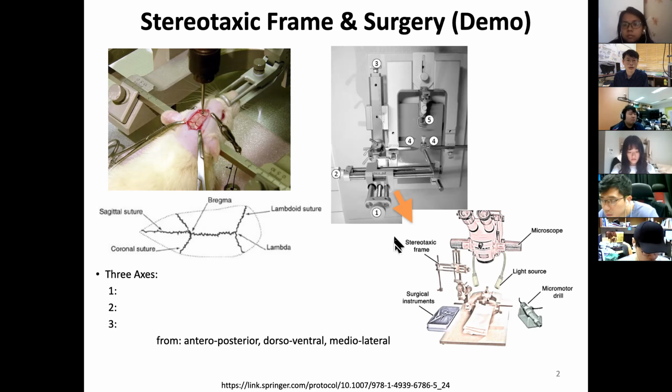So let me check. Ji-hoon, maybe it's a good time to give you a reminder. What will this number 1 be out of these 3? Like the 1, 2, 3 axis. Choose out of these. This is vertical, back to belly.